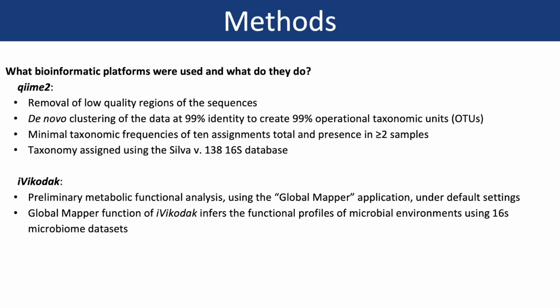v138 16S database. Using iVikodak, preliminary metabolic functional analysis was performed using the Global Mapper application under default settings. This feature was used to infer the functional profiles of microbial environments using 16S microbiome datasets.